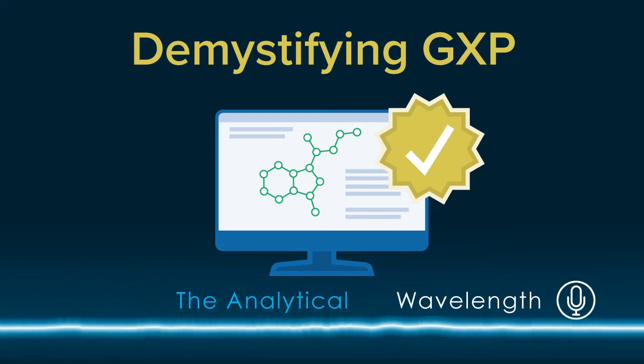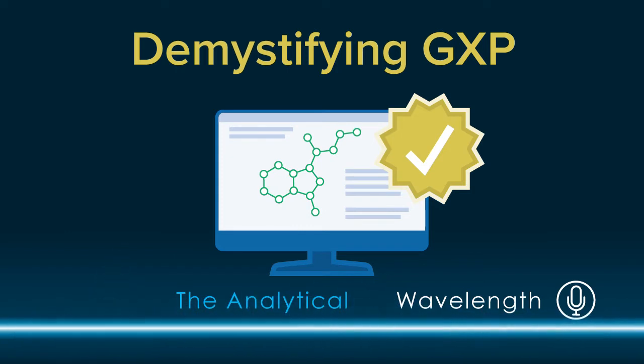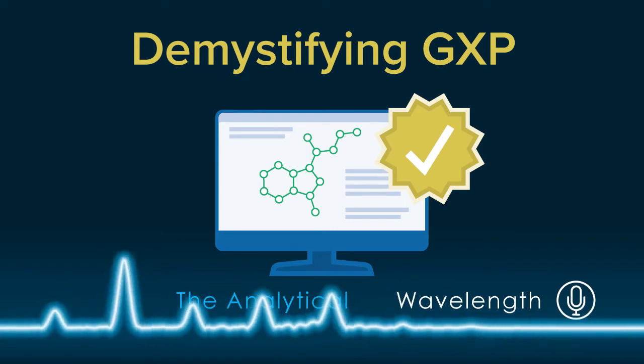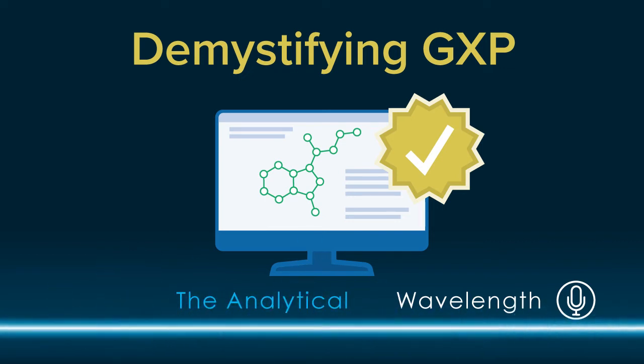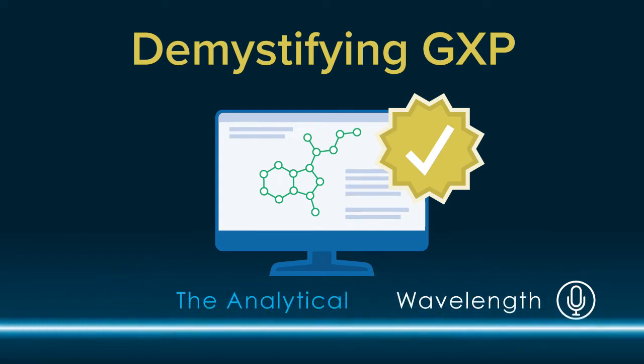One of those things is an audit trail. And this audit trail needs to be created at the point in time when a record is first saved to durable media. The audit trail must contain the date and timestamp of any change if it was made, the description of the change, the reason for the change, and the name of the person who makes the change. An audit trail must not obscure previous values. So an old value that was there previously must still be visible. And then the new value is displayed for the user.